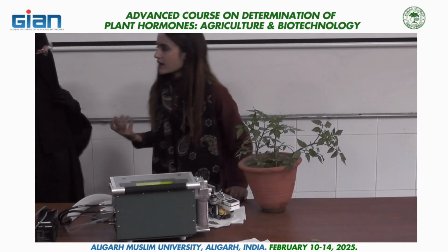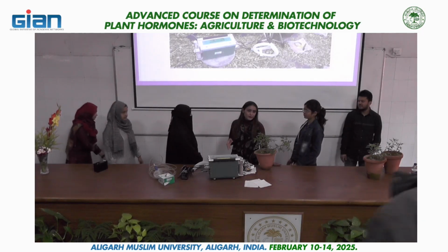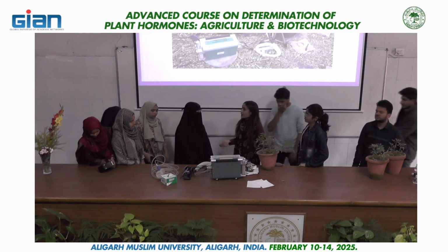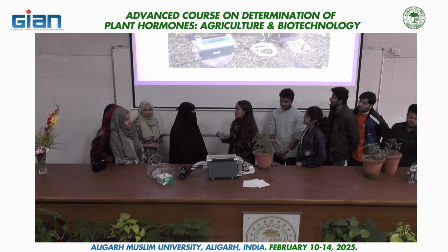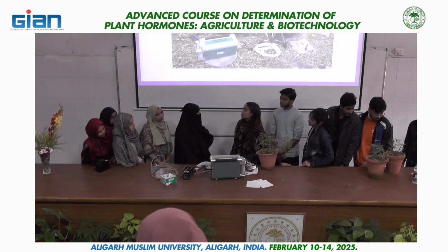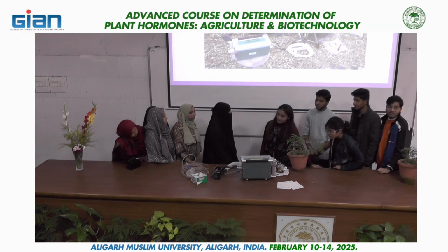You can treat it with any kind of stress, any abiotic or biotic stress. For example, as our work is on abiotic stress, you can take salt stress, heavy metal stress, drought stress, high temperature stress, low temperature stress. It's up to you, whatever stress you are taking. This plant is treated with chromium, a heavy metal stress. It completely depends on the concentration you are applying. The higher the concentration, the more negative effect you will see. Fine.